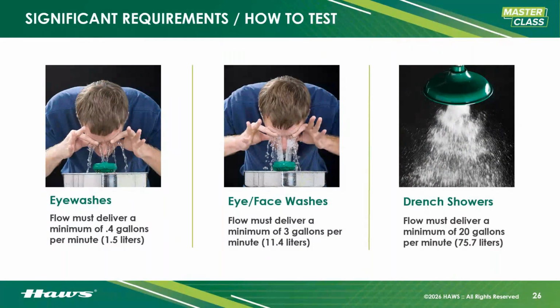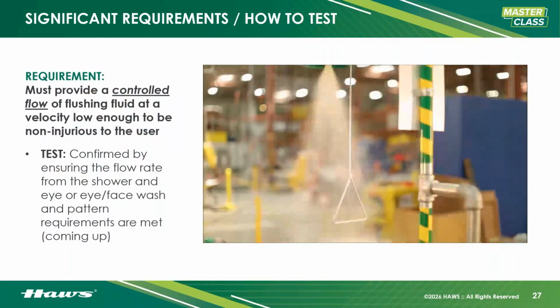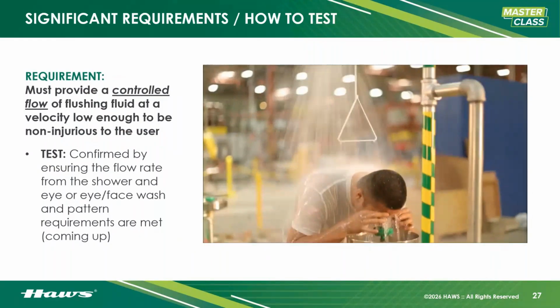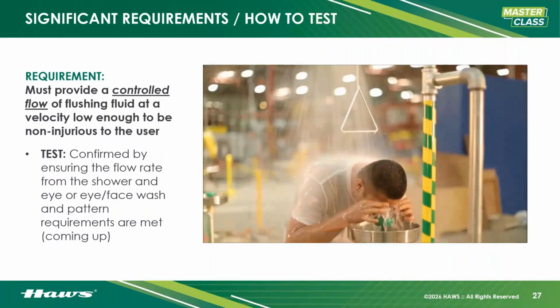And we have to consider victim comfort, right? We may have corrosive materials on our body. Our skin may not be in the best shape and things of that nature. And our eyes are sensitive. If I have an immense amount of water spraying at my face, it is going to be incredibly uncomfortable. So we need to focus on a controlled flow, something that is gentle yet thorough across our entire body. We do not want gaps in this spray.